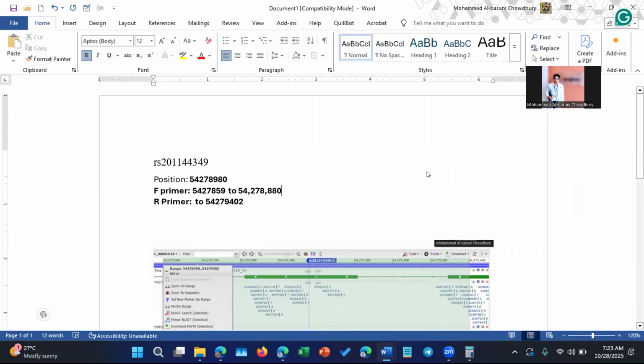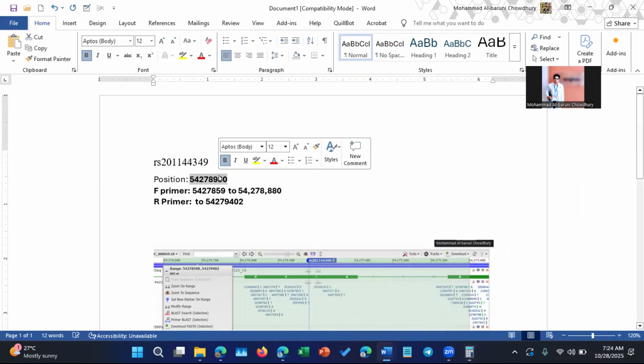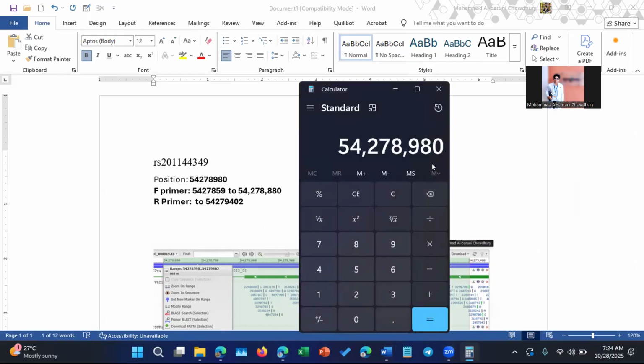Okay, probably right. Yeah, there's some problem. Okay, clearing it again. There is some problem with copying. Yeah, now it's okay. Minus 50. It's this. That's the cut.